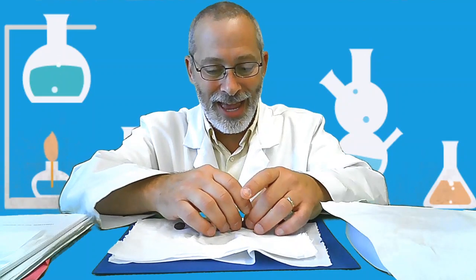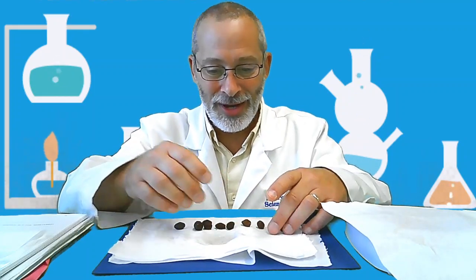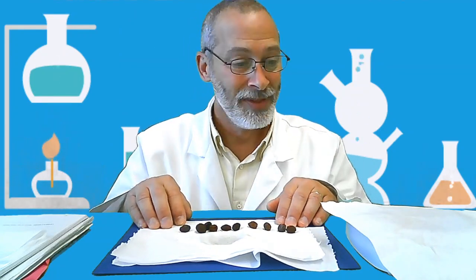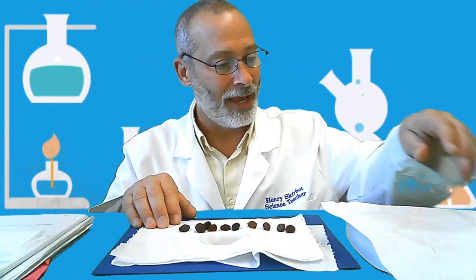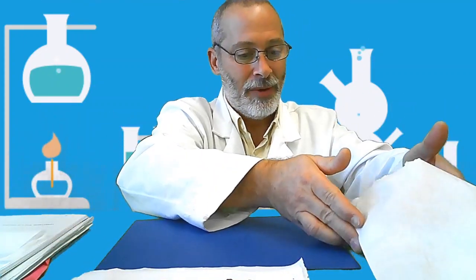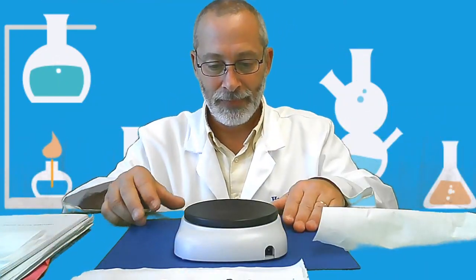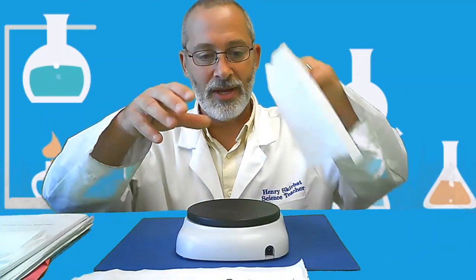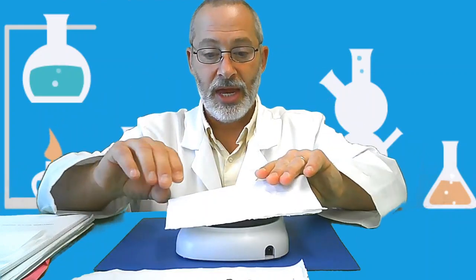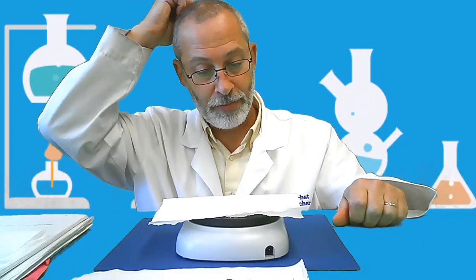They are getting plump after only one day of being in the water. Can you see how much bigger they are today than they were yesterday? So let's get the digital balance going here, and we'll get the mass of these raisins for day 2, and then you can finish up your lab activity.